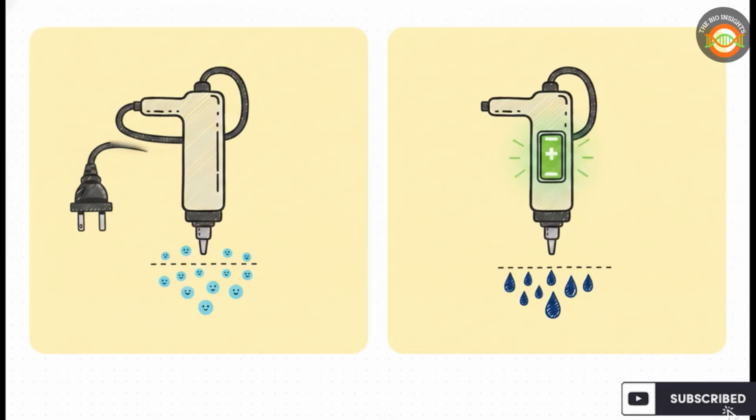Thankfully, modern engineering swooped in and gave us autoclavable dissolved oxygen probes that use some really clever electrochemistry. Generally, we rely on two main principles today: polarographic and galvanic. Now, both use a special plastic membrane that lets oxygen gas slip through while blocking liquid and ions. In the polarographic method, we actually apply an external voltage of 0.6 to 0.8 volts to a noble metal cathode, like platinum or gold, sitting in a neutral potassium chloride electrolyte.